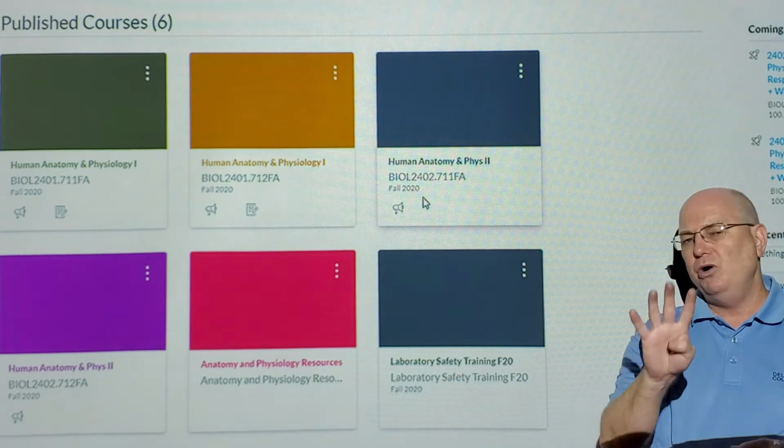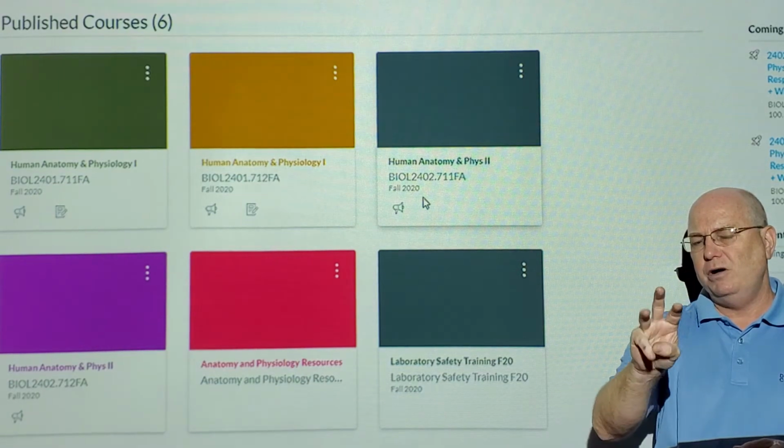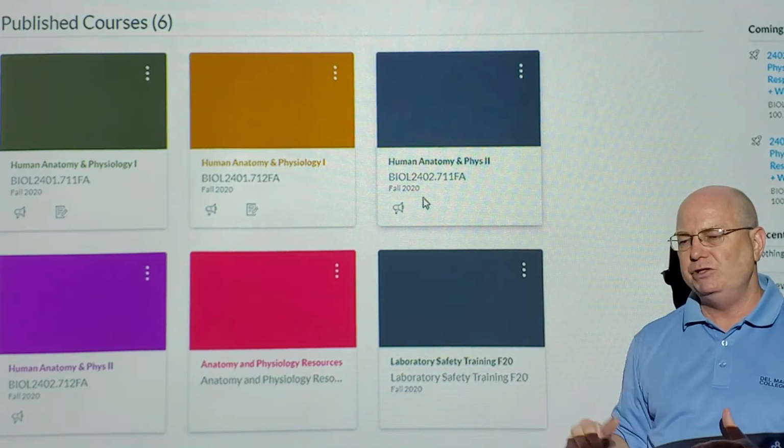For our lab, we're only going to look at 4 for now. We're going to look at simple squamous, simple cuboidal, simple columnar, and then stratified squamous epithelial tissues. For lab, you have to be able to identify the type of tissue.